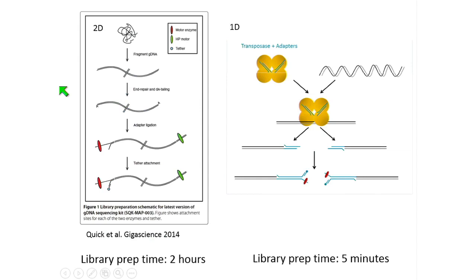When this technology was introduced, one of the exciting ideas presented at AGBT in 2012 was that you'd be able to just take a clinical sample and dump it straight into a nanopore and start sequencing. Sadly, that's not the case. At the moment, you still need to make a sequencing library, which is not actually dissimilar to sequencing libraries that you make on almost any other platform.